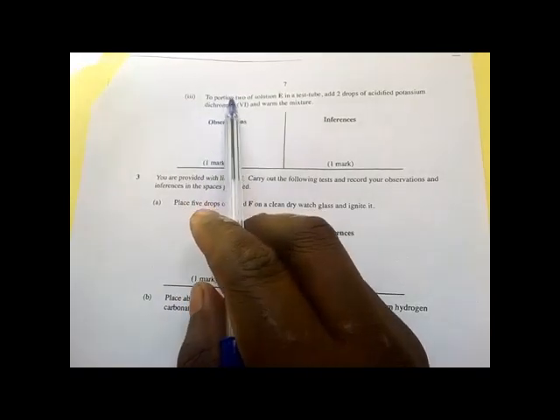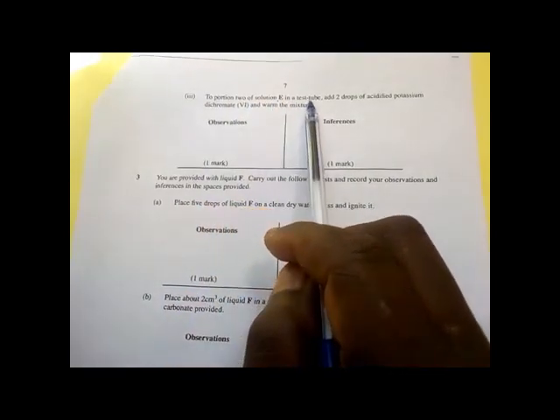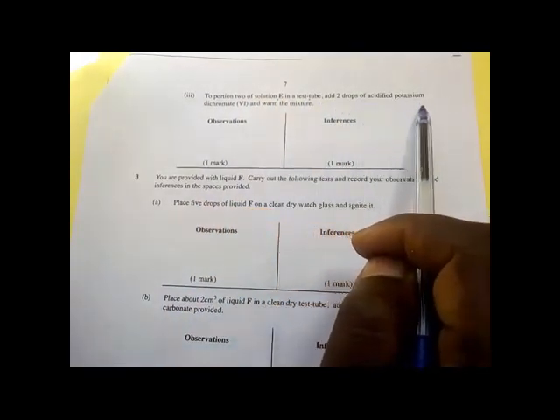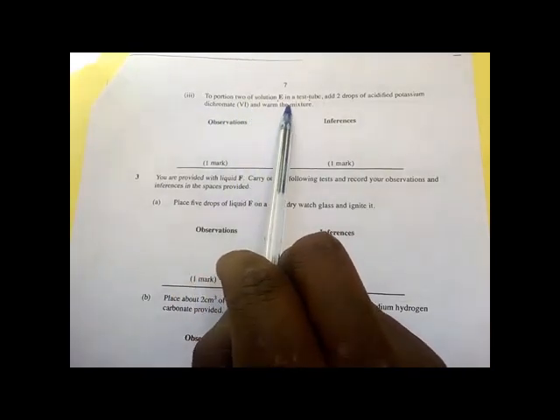To portion 2 of solution E in a test tube, add 2 drops of acidified potassium dichromate(VI) and warm the mixture.